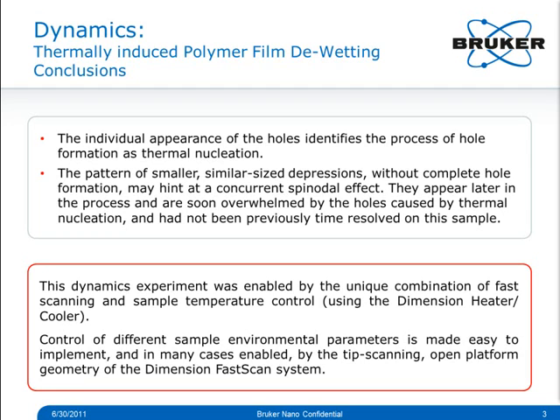The fastest sample scanning AFM with feedback, the one from Professor Ando in Japan, uses a 1 mm mica disc directly glued to the scanner for this reason. Scanning the mass of a sample heater plus the required heat isolation from the scanner is somewhere between difficult and impossible at high scan speeds. A fast tip scanning AFM is entirely unaffected by this problem.